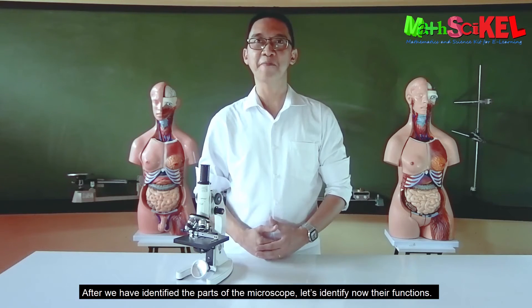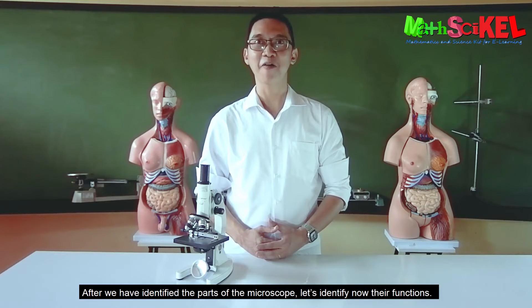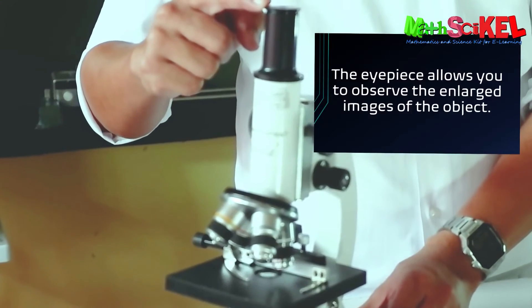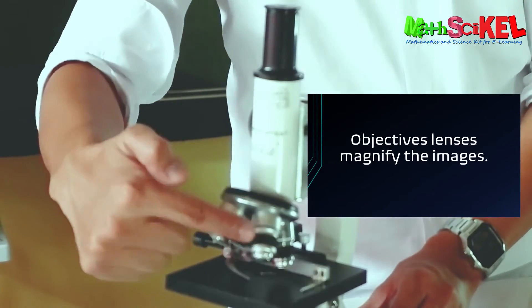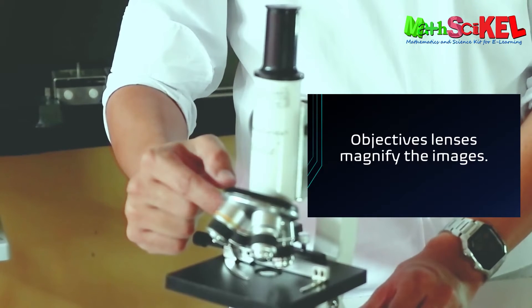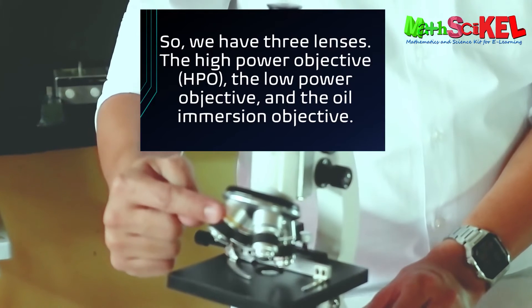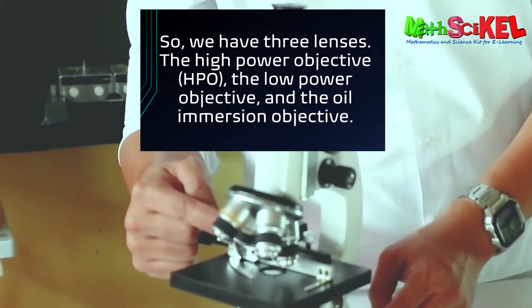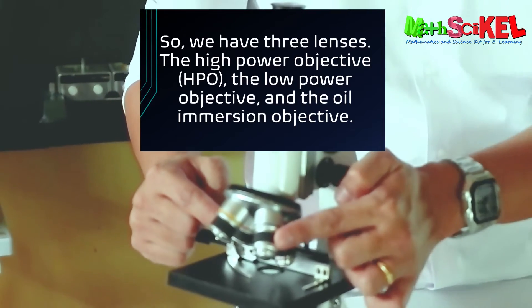After we have identified the parts of the microscope, let's identify their functions. The eyepiece allows you to observe enlarged images of an object. Objective lenses magnify the images. We have three lenses: the high power objective, the low power objective, and the oil immersion objective.